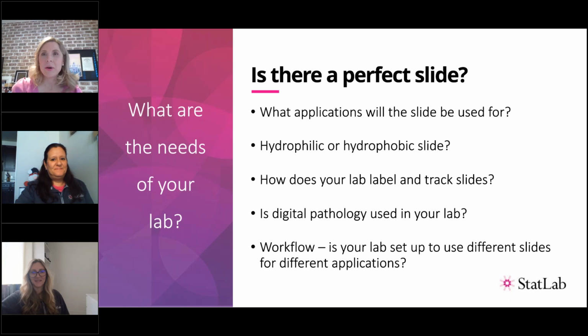So one of the things that we seek to understand is, what are the needs of your lab to help you find that perfect slide? And we're going to talk through all the different variables and factors, and then talk through a little bit more about what other things you can use to find that perfect slide. So a couple of basic questions, what applications are you looking for? Is this just for IHC? Is it for routines? Is it for specials? What Rachel hinted at earlier, hydrophilic or a hydrophobic slide.